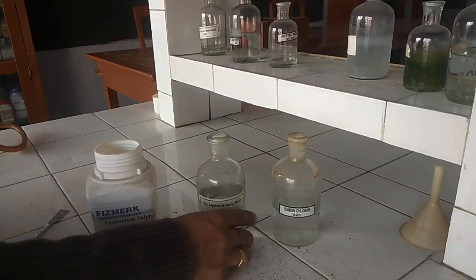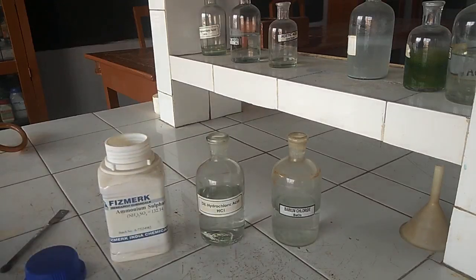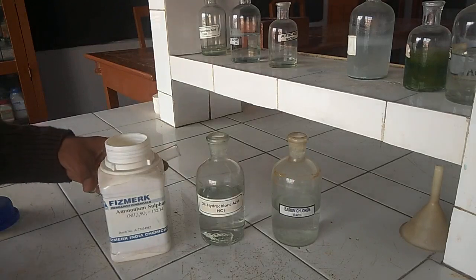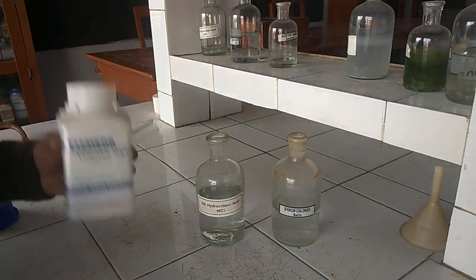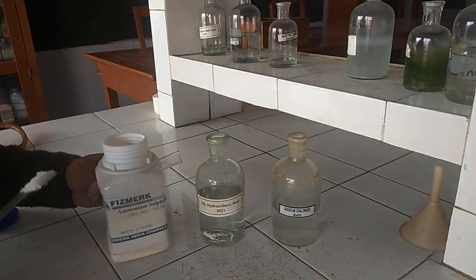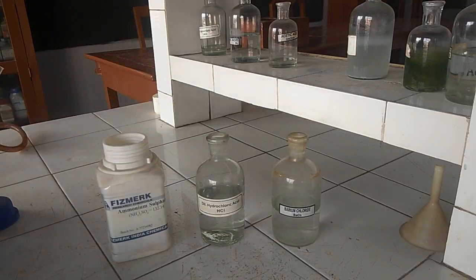Move on to the third category, or group 3, of acidic radicals. The radicals belonging to this group are sulfate and phosphate. These radicals do not give any test with either dilute HCl or H2SO4 or concentrated sulfuric acid. These radicals have a specific test. So we will test sulfate of this group, and for this we need a salt containing sulfate anion, as well as dilute hydrochloric acid and barium chloride solution.